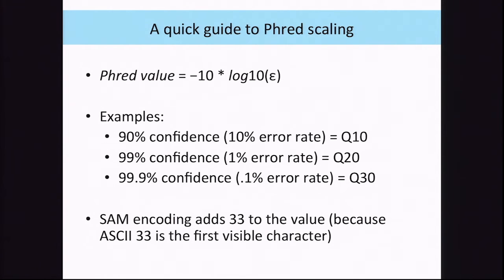All right, so what is Phred scaling? It's basically a nicer way to be able to talk about confidence, about error rates. We have some very high quality sequencers now, where you might have an error rate of say 0.001, 0.00001, but that's just going to be cumbersome to be talking about all day. So we have this transform into a quality score.